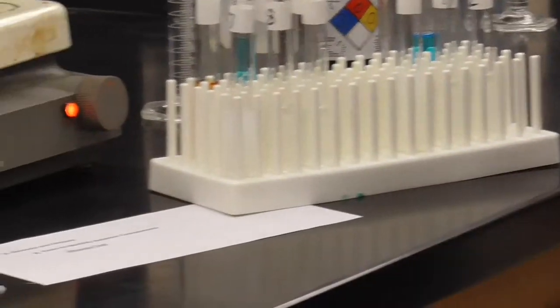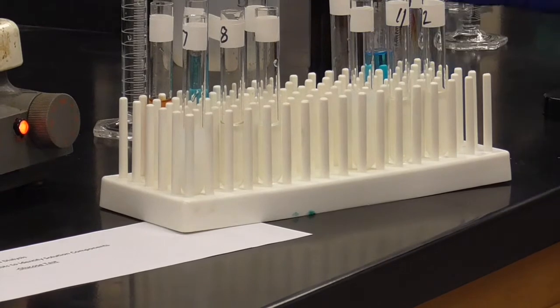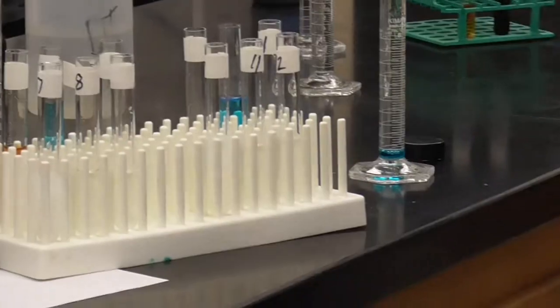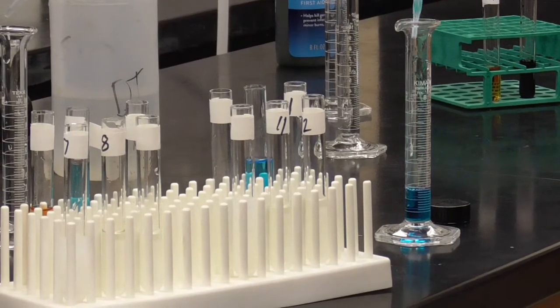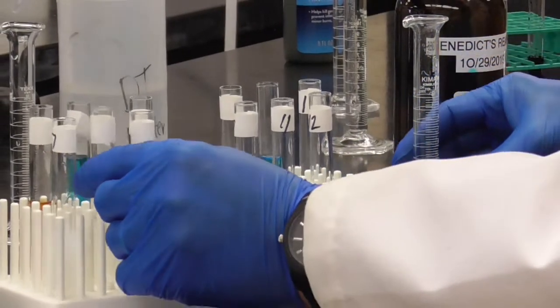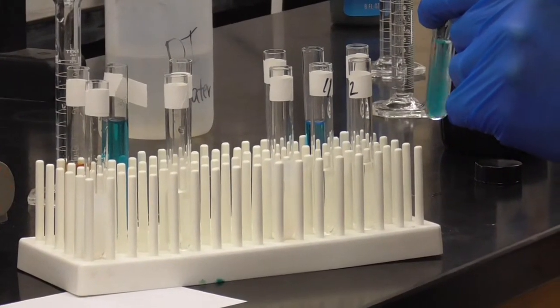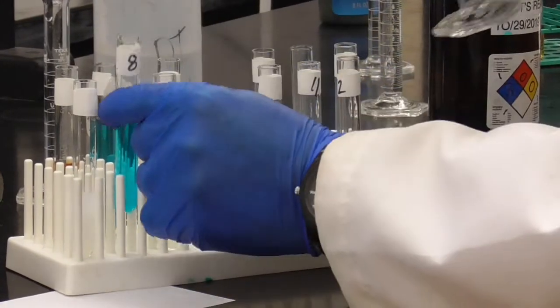Glucose. We go ahead and add our 3 milliliters of Benedict's reagent. Here so you can see it. There's 3. We'll put that in the second test tube here, so test tube number 8. Okay.